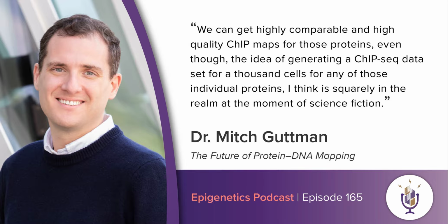And so even that alone becomes a really valuable proposition in terms of thinking about total cell numbers and access. But in practice, we've also found that by being able to map many proteins together, we can also effectively reduce the total number of cells that we can use going into a ChIP-dip experiment relative to an individual ChIP experiment.